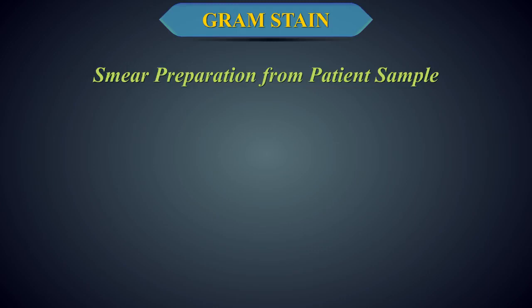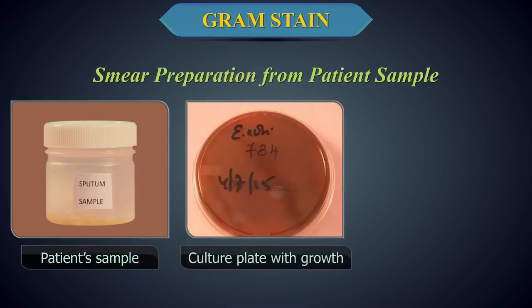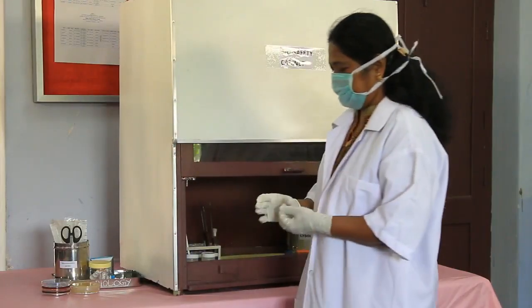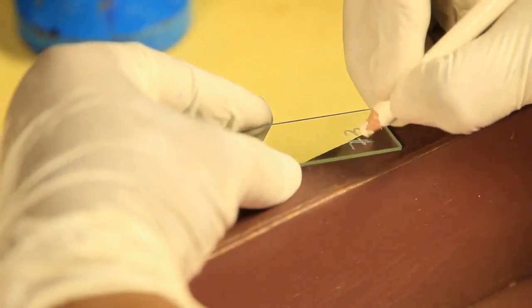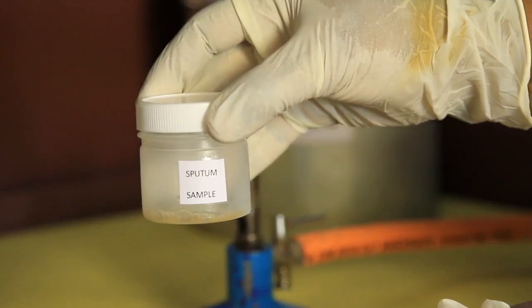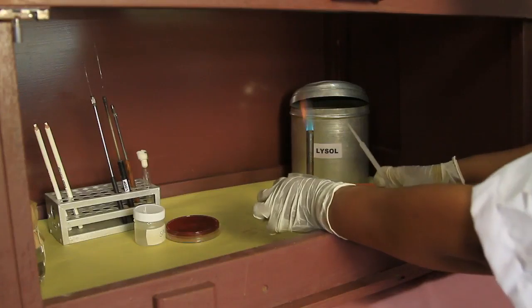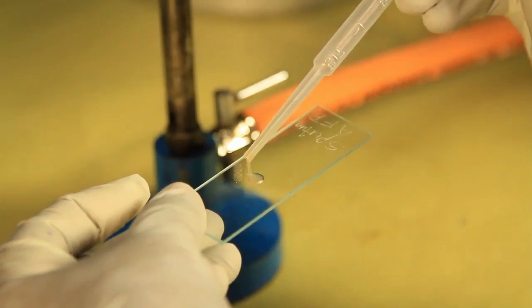Smear preparation from patient sample. Smears can be prepared directly from the patient's sample, culture plate with growth, or from broth culture. For smears directly from the patient's sample, take a clean, grease-free slide. Label it with patient ID or lab number. With a sterile inoculating loop or dropper, place a small amount of purulent portion of the patient's sample, for example, sputum, pus, etc., onto the middle of the slide.